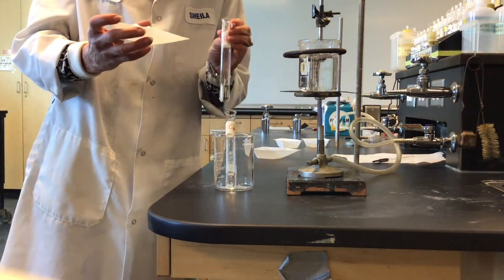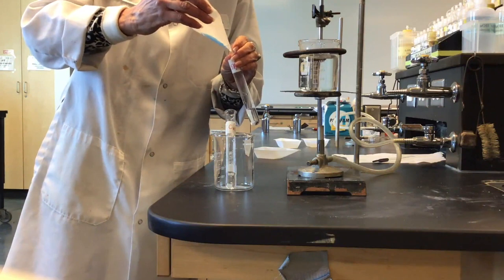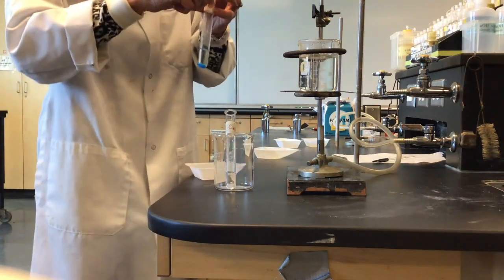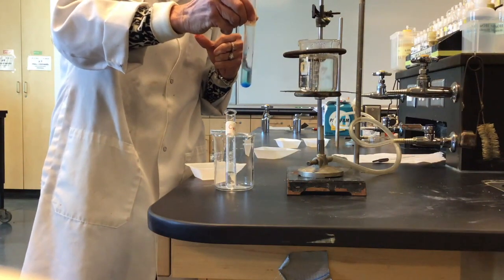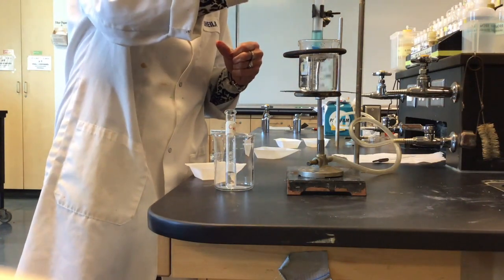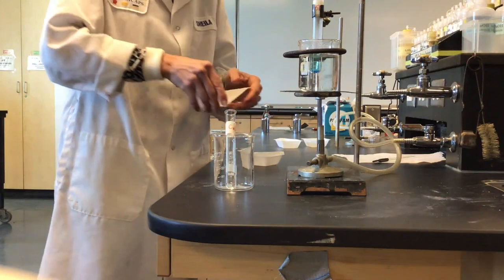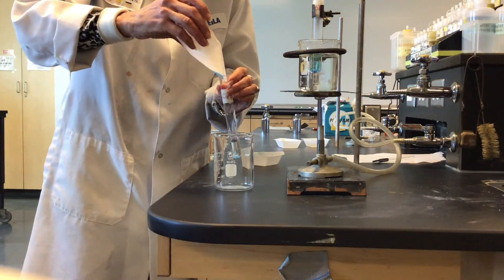Now we're going to add our copper sulfate pentahydrate into each of our test tubes. The thing that's sort of handy with these weighing boats is you can bend them a little bit to help you get it inside without spilling any. And you can swirl it a little bit to help dissolve it. And we can see it's not dissolving. I'm going to go ahead and put that one in the hot water. Make sure it's completely submerged in your hot water. And then I'm going to add my other 0.5 gram increment of copper sulfate pentahydrate to the one that's at room temperature.